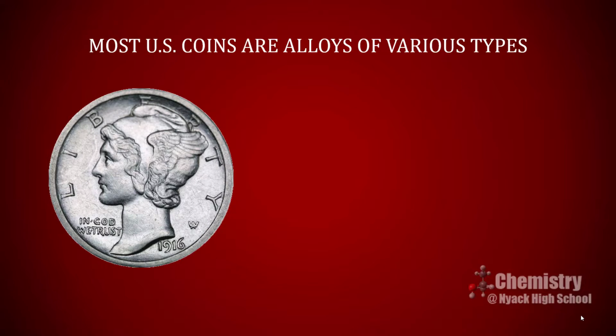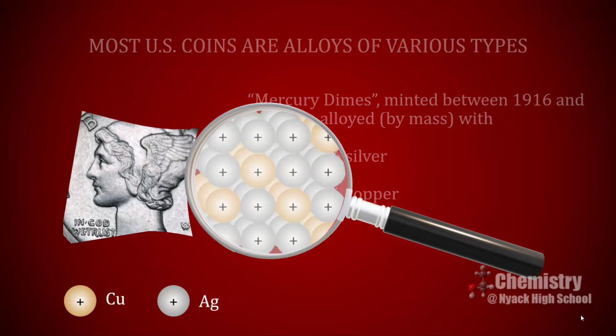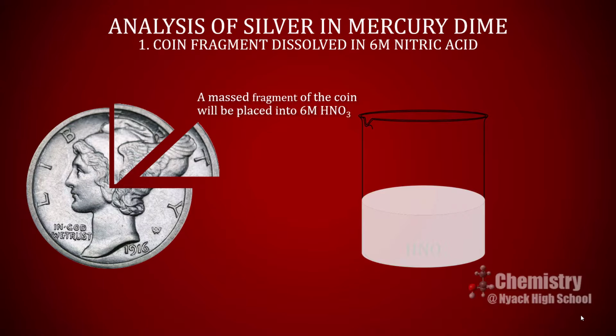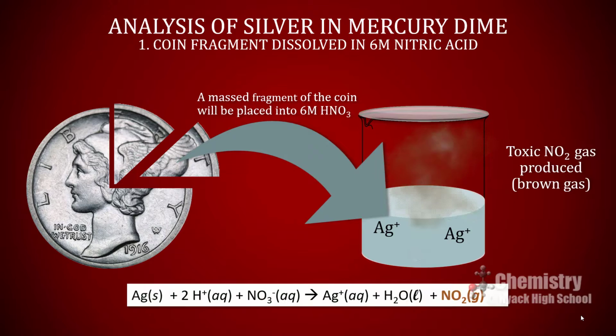The so-called mercury dimes minted in the years between 1916 and 1945 are alloyed with silver and copper, 90% silver and 10% copper by mass. We're going to confirm these percentages through a gravimetric analysis. The first step is to take a small measured fragment of the coin and dissolve it in 10 milliliters of 6 molar nitric acid. You will notice that a brown gas, nitrogen dioxide, is produced, and over time the solution will turn a bluish green due to the presence of dissolved copper ions in the solution.